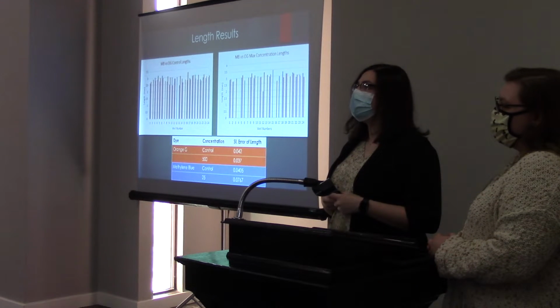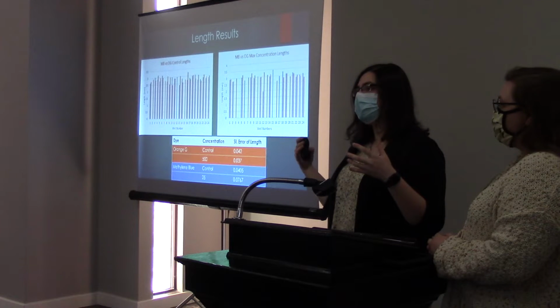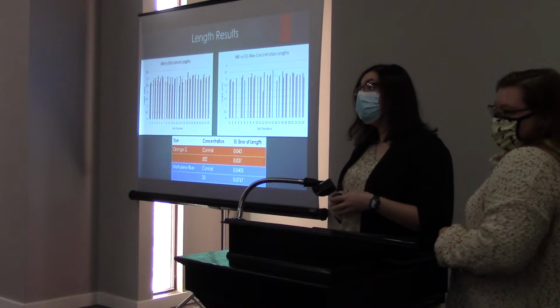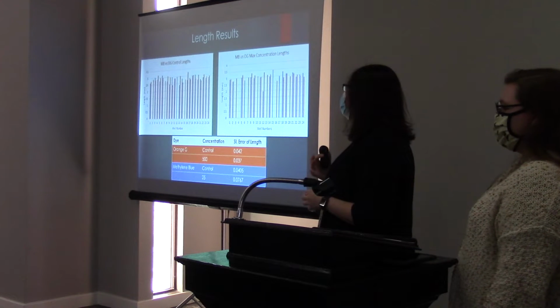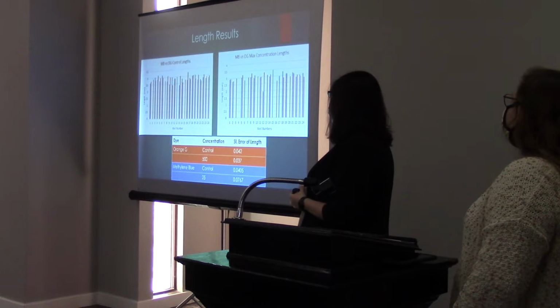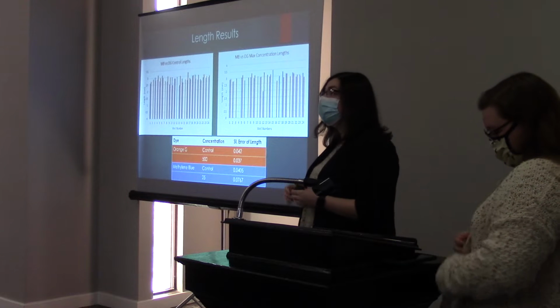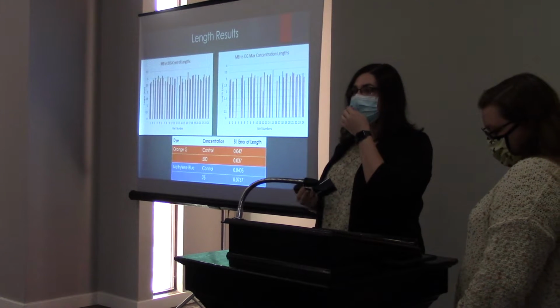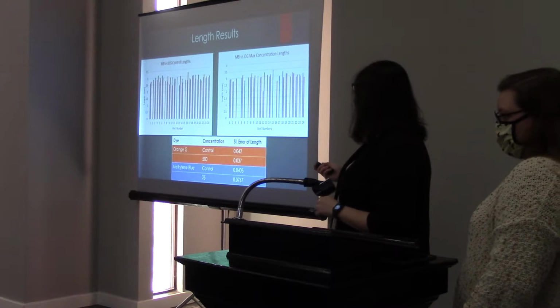The way that our measurements went is trying to get them into the right position in order for the measurement to be taken through our measurement program. However, it did not work out that well for that singular one. We have our standard error link here at the bottom, and as you can see, there's no real big difference between any of them. So no deformities, no difference in length when it concerns these dyes with these shrimp.